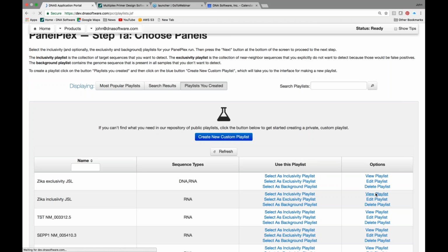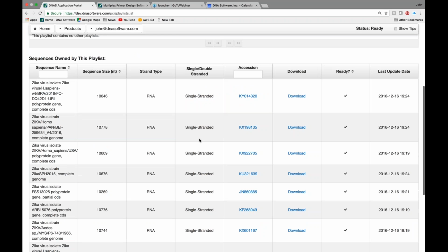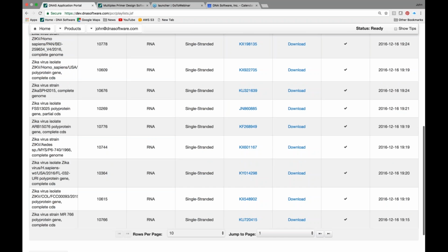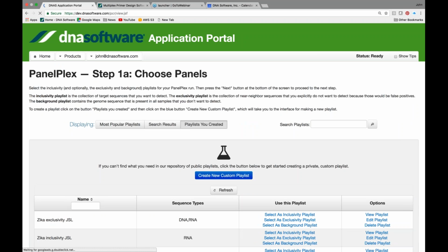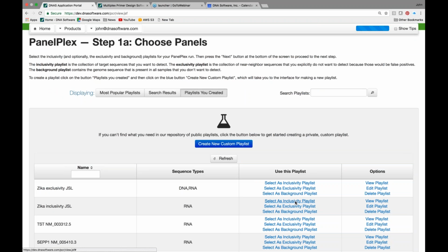So here's an inclusivity playlist for Zika virus, for example. It has all 168 Zika viruses, and here they are. All of them are listed. You can see them on several different pages here of Zika virus variants. And we're going to choose that to be our inclusivity list for today. All right, so it's as simple as just hitting select as inclusivity playlist. All right, just wait until that takes that in.